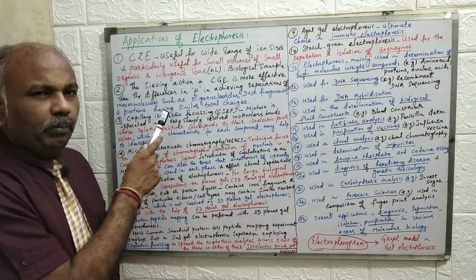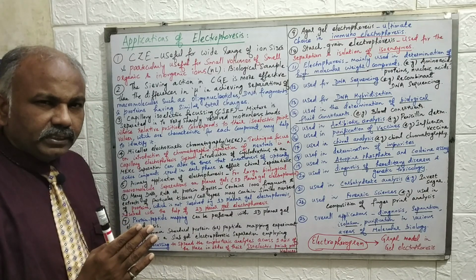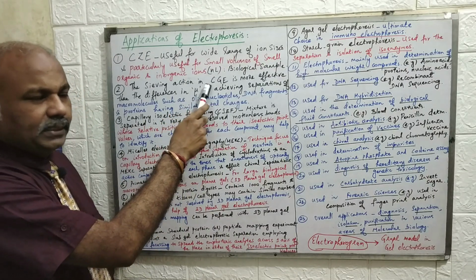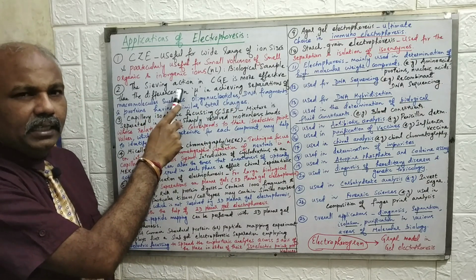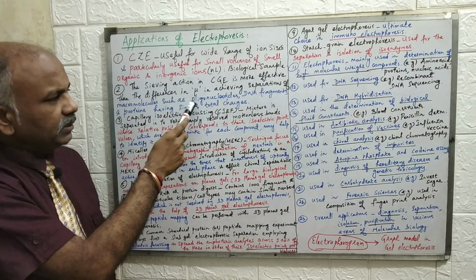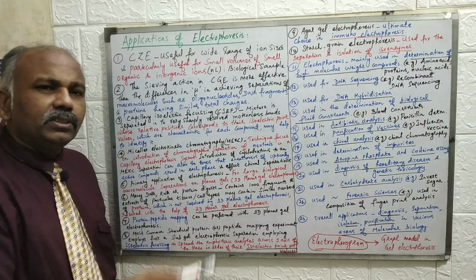The second important application is the sieving action in capillary gel electrophoresis. As I told already, capillary gel electrophoresis is a slower phenomenon compared with zone electrophoresis. And here in capillary gel electrophoresis, we have the sieving action, which is more effective than the differences in electrophoretic mobility in achieving the separations of macromolecules such as oligonucleotides, DNA fragments, and proteins having similar total charges.